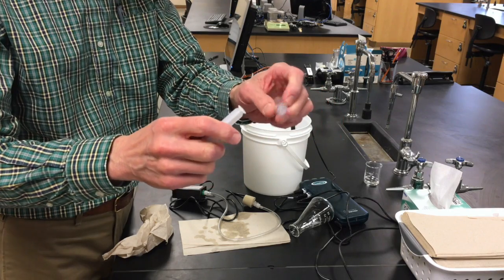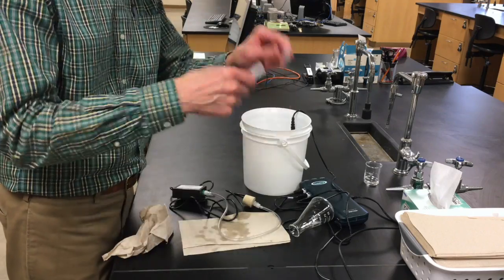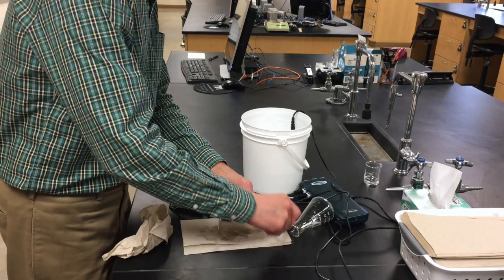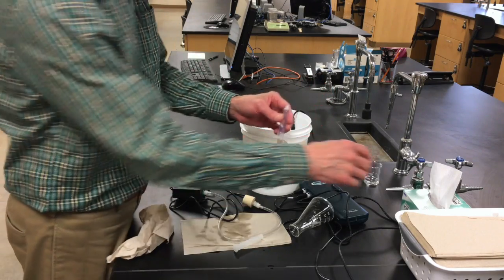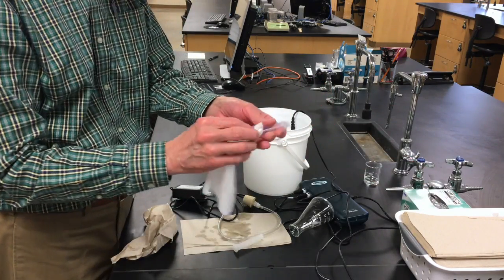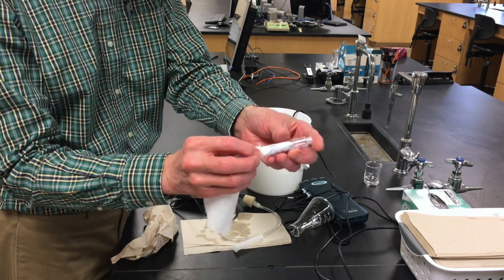All right, and then shake these parts out. Dry them with a dry paper towel. Look through here. The paper towels are sort of big, but you can put a Kim wipe down the barrel here, like that.